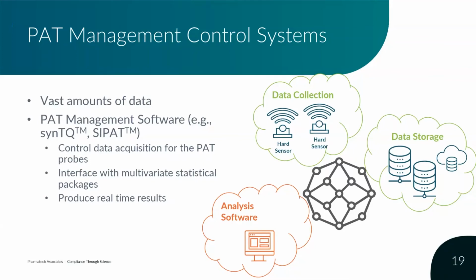If the wrong probe is selected, or if your placement is not optimized, retrofitting equipment and changing PAT probes can add exorbitant cost to the process.